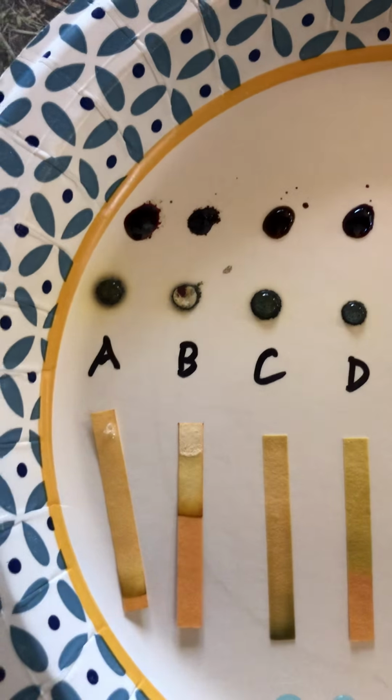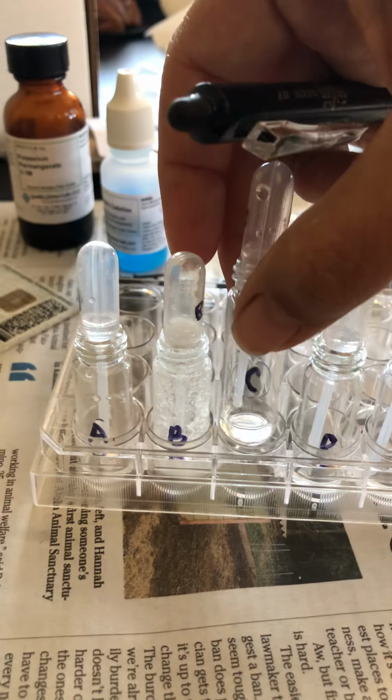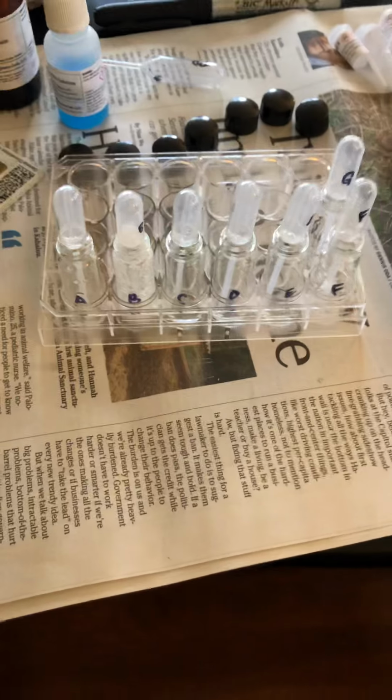Also, C here also solubilized rather well. So I know that it wasn't caffeine or thymol, because caffeine is only mildly soluble and thymol is not soluble in water at all. So I ended up choosing xylitol. Sodium acetate shouldn't have created a reaction with the potassium permanganate.